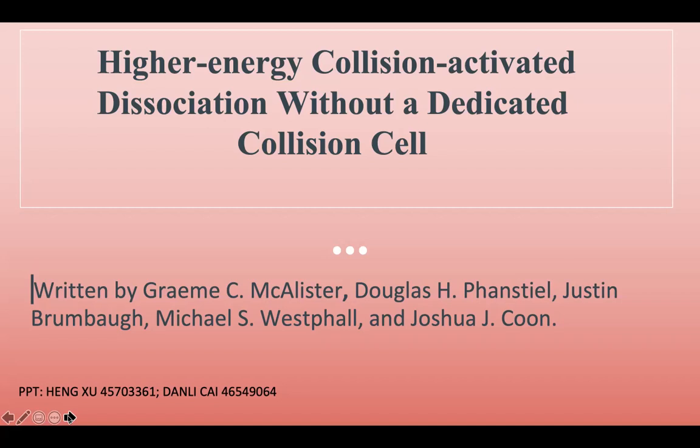This article was written by Graeme, Douglas, Justin, Michael, and Joshua, etc. Basically, this article is about an upgrade of HCD called IHCD, and IHCD is compared to other dissociation methods for efficiency.